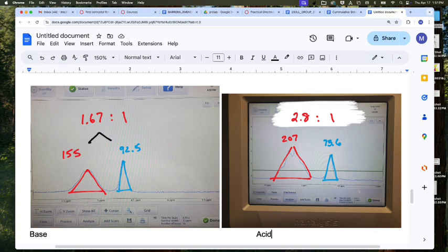There's more hydrogen. The acid one produced more of the signal at the 5.3 than the base one. That's kind of interesting. That might require a different question.